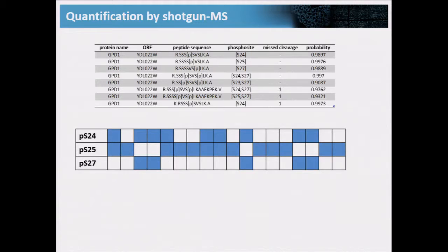This is just figuratively drawing a quantitative table where we would have different site assignments, and then sometimes we get a value, sometimes we don't, sometimes it looks kind of complementary, and we're not sure what's going on. Are these real missing values? Is this a problem with the alignment? Are these different phosphopeptides? What's the deal?